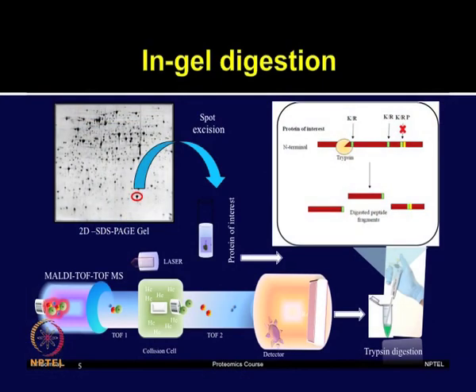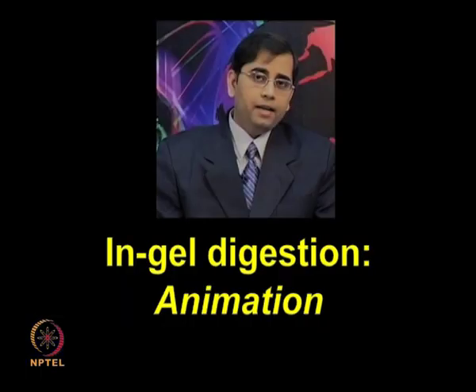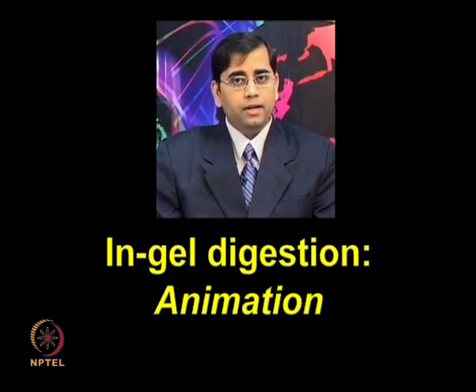This slide gives you an overview of various steps involved in the in-gel digestion. I have discussed this in more detail in the previous lecture while discussing multidimensional MS. So, you can refer to more detail over there, but just to refresh the concept, I will talk about this again in the following animation of in-gel digestion.